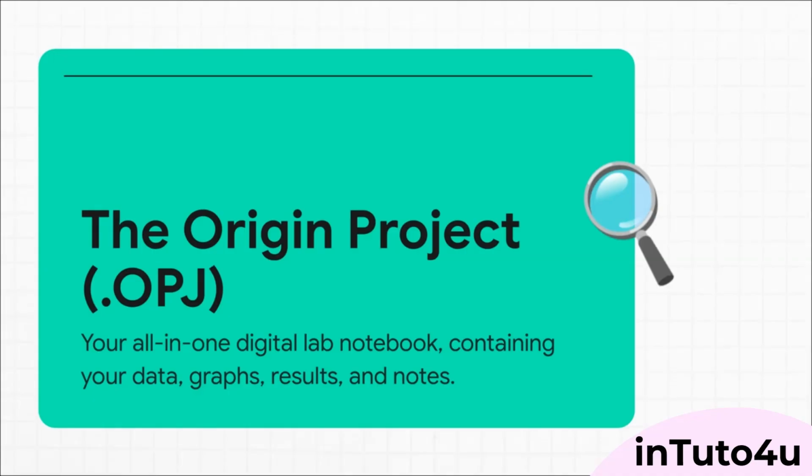Really gets to the core philosophy behind Origin integration. Everything related to your project lives inside one single Origin project file. So think of it less like a file and more like a digital lab notebook. Your raw data, your graphs, your analysis, your notes, it's all bundled together in one cohesive place. No more hunting for scattered files.